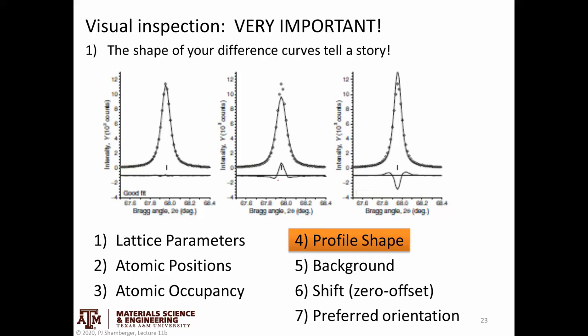I call these patterns W's or M's in the difference curve — an oscillating pattern of down-up-down or up-down-up. These are indicators that your peak shape is not quite right: you're overestimating the observed data here, underestimating it there, then overestimating again — meaning your peak is a little too wide or a little too narrow. From the instrument side, there are a number of instrumental parameters. When we talk about U, V, W, X, and Y, these are parameters that define the function we use to fit peaks. Things like grain size or residual strain in the material can also affect peak shapes.